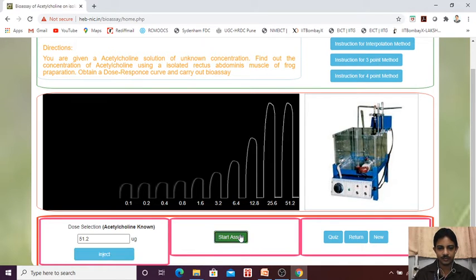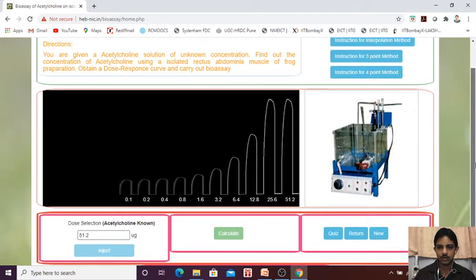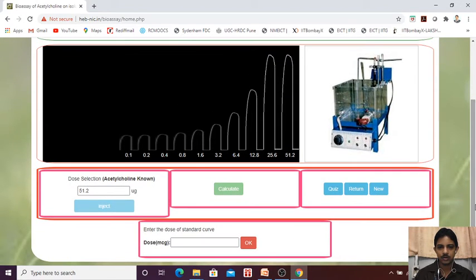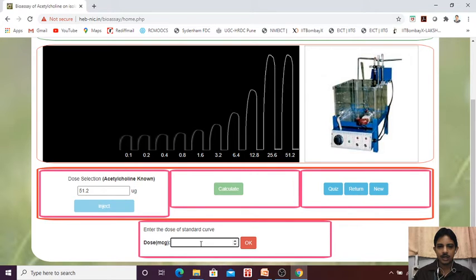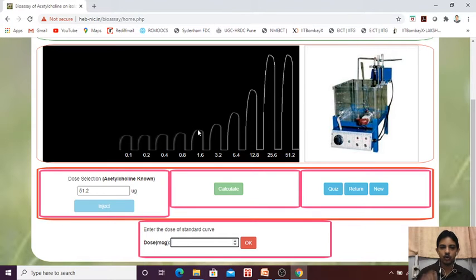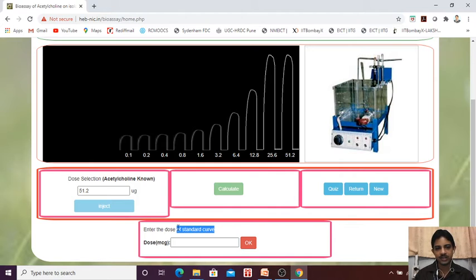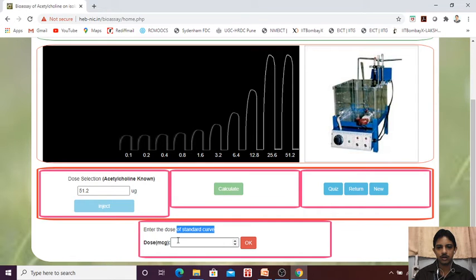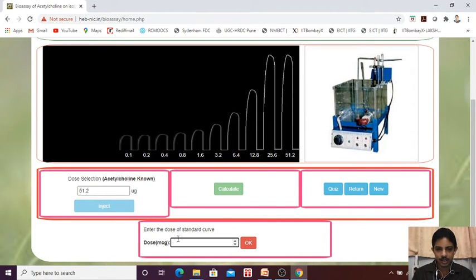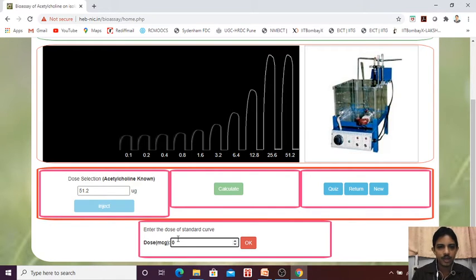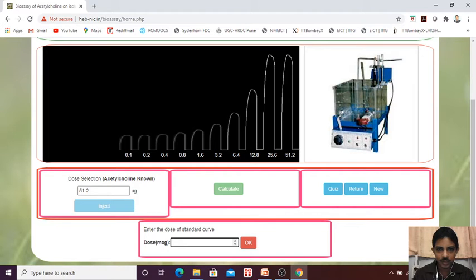Start assay. From this we need to identify one dose from the standard CRC. Let us standard CRC. What is the dose? I will find that here, what is the dose? We will find that 6.4.